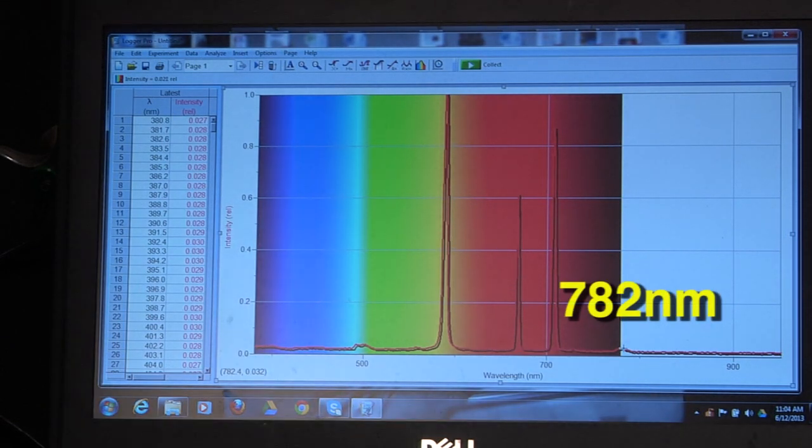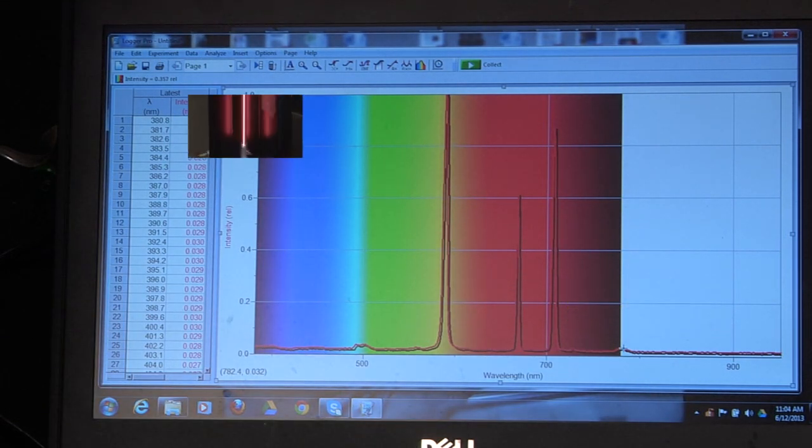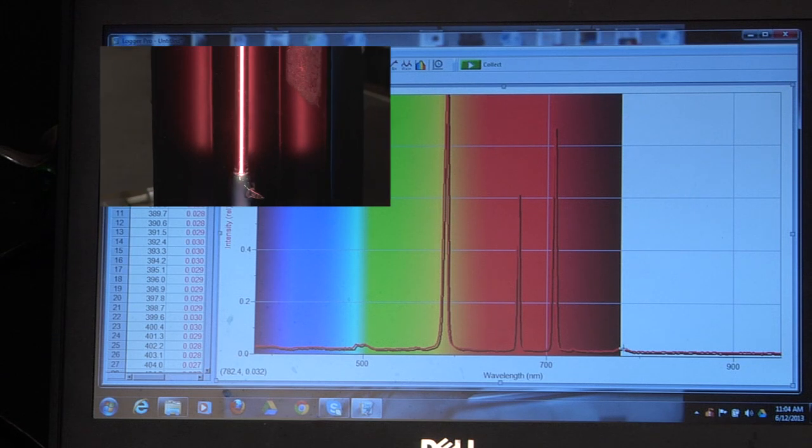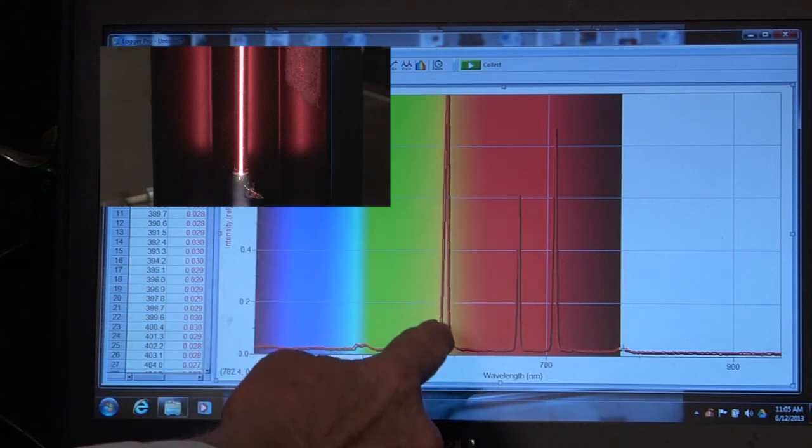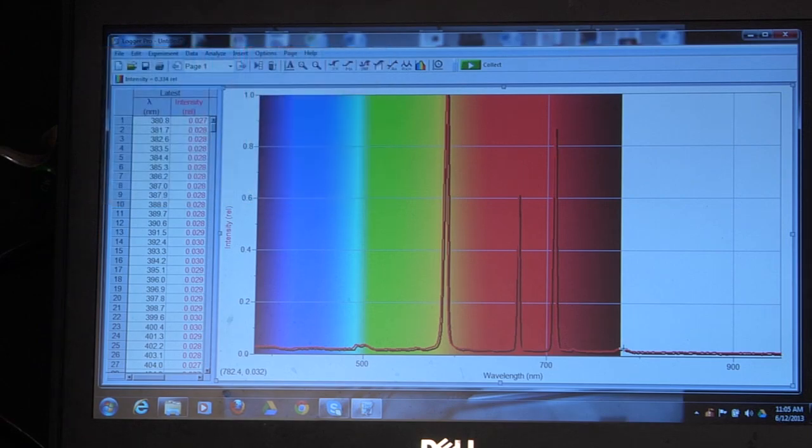But if you go back to our tube, you can see that it's yellow. It corresponds pretty much to this very intense yellow emitted in this range.